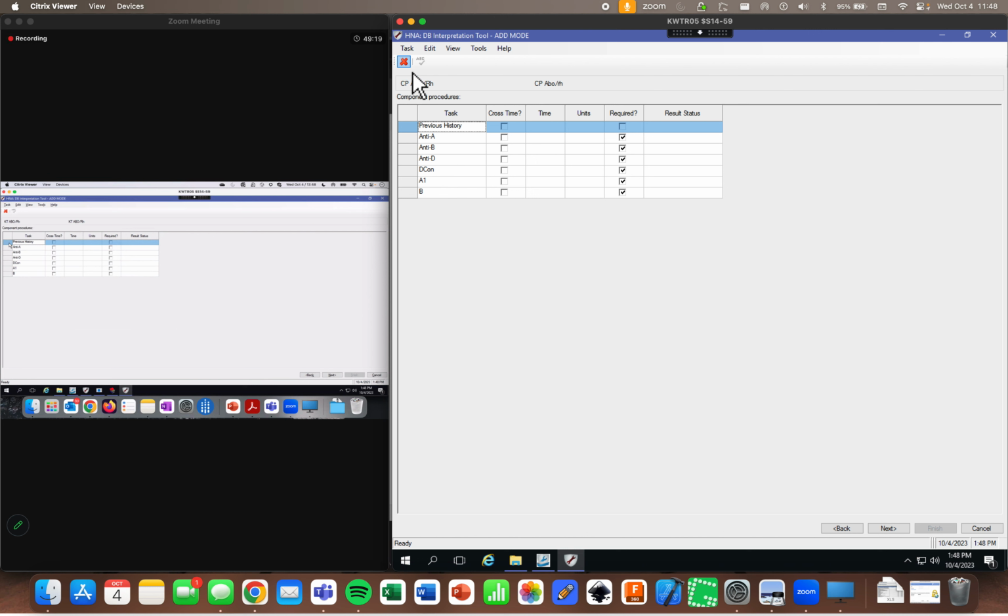What you're going to want to do is select that row, and you're going to do that by clicking the button that's on the left-hand side of the table. I know it looks like it's just part of the table, but it is actually a button. So you're going to click that button. It'll highlight the row, a nice pretty blue color.